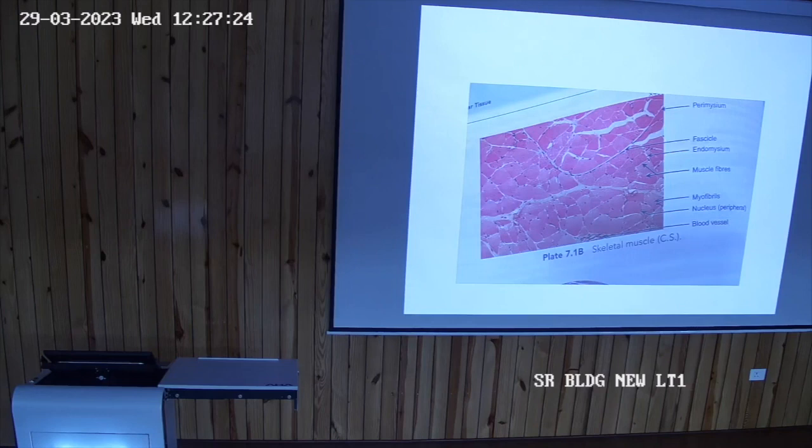So that part, which is the whole of the muscle, is covered on the outside by a connective tissue layer that is called epimysium. That is called epimysium. Now look at each bundle. Take any one bundle. See this bundle. You are seeing these lines surrounding this bundle, and that line around this bundle is called perimysium. So try to understand. The whole muscle is covered peripherally outside by a connective tissue layer, that is called epimysium.